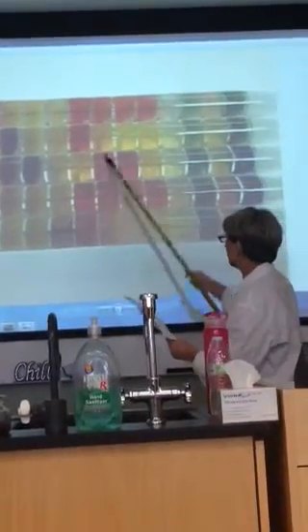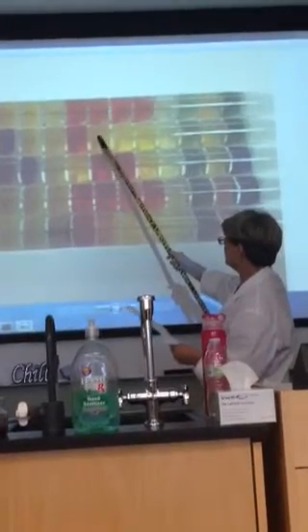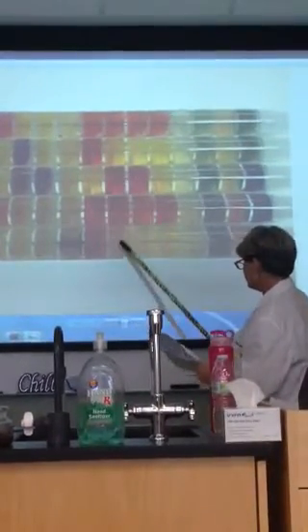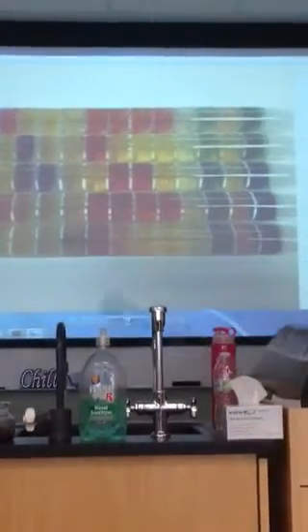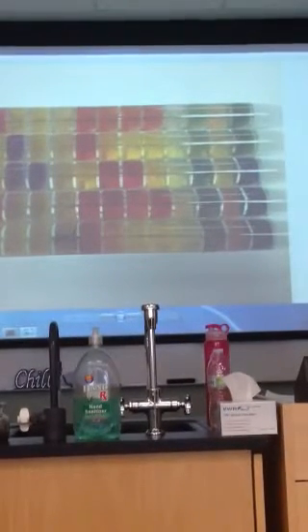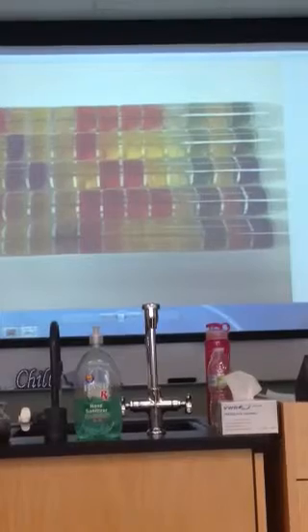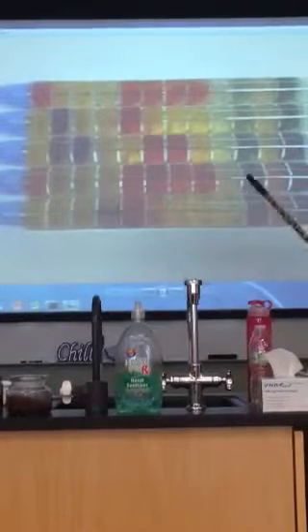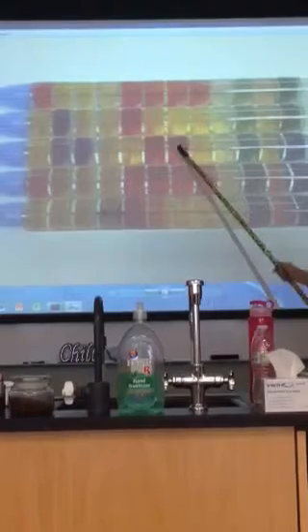The next one is lactose. Friendly lactose fermenter, E. coli. Serratia, unfriendly, non-lactose fermenter. Citrobacter, friendly lactose fermenter. Citrobacter, Enterobacter, and E. coli are all the friendly lactose fermenters. Serratia, Shigella, not so much. These are other sugars. See the difference in the patterns?